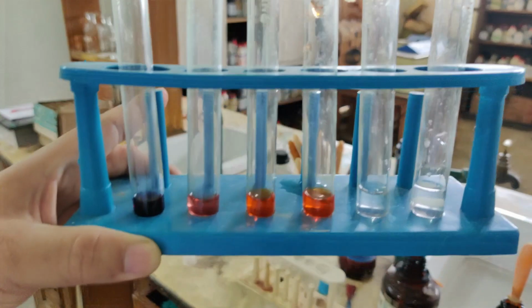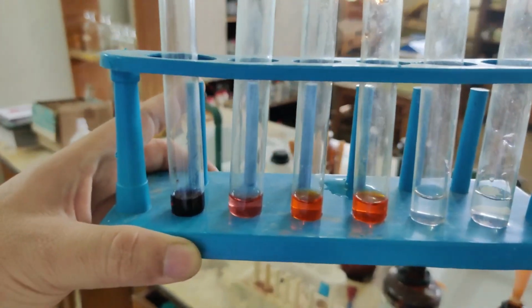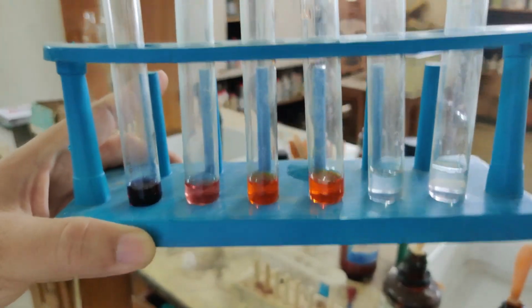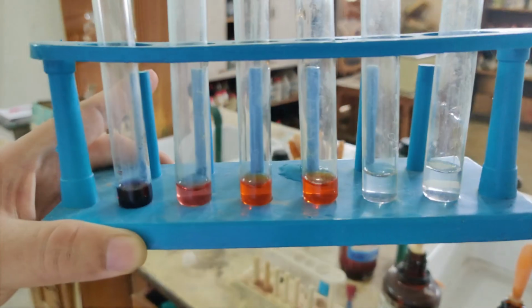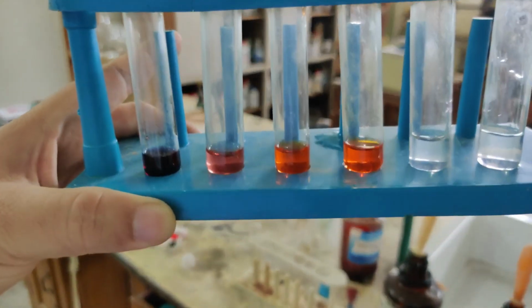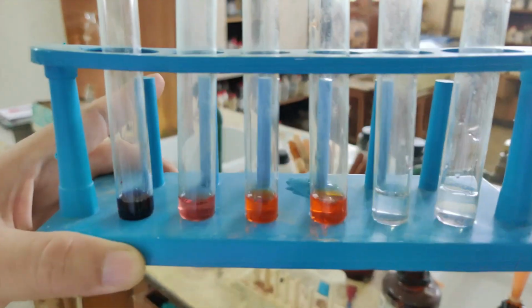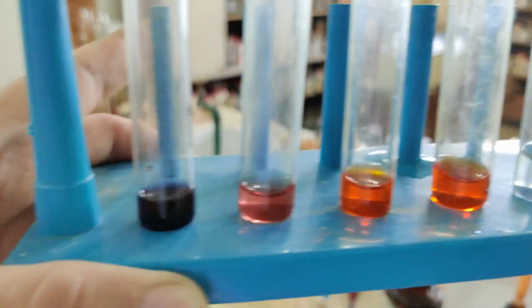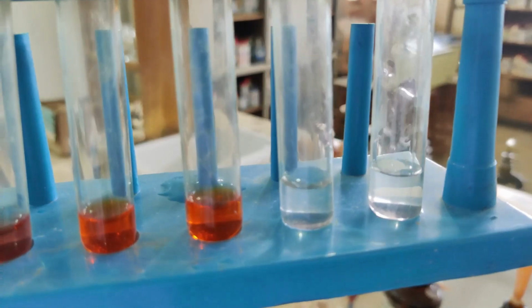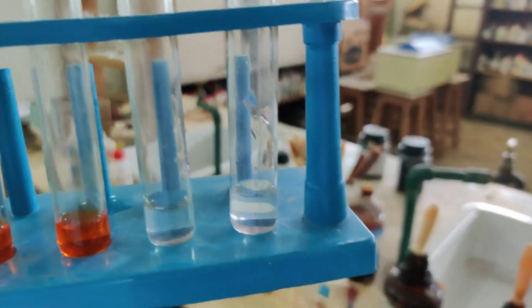One is an acid, the other one is a base, and the acid is dilute hydrochloric acid. You can use any acid you like, but I would prefer to use dilute hydrochloric acid, and the base I am going to use is ammonium hydroxide. So let us see what color change. Now see again for the last time what the color looks like. See blue litmus, red litmus, methyl orange, both of these are methyl orange, and both of these are phenolphthalein.